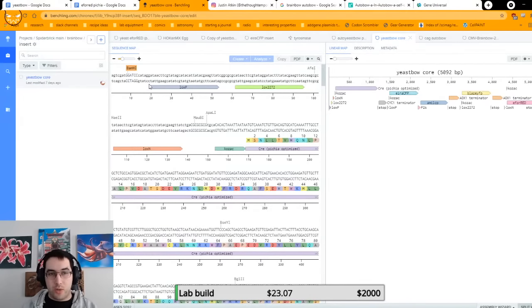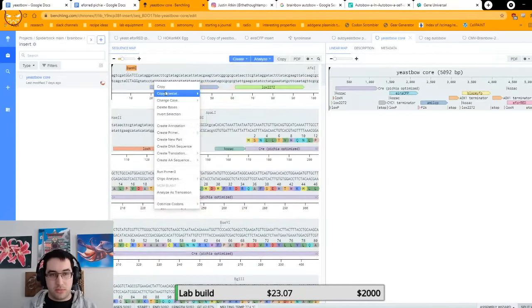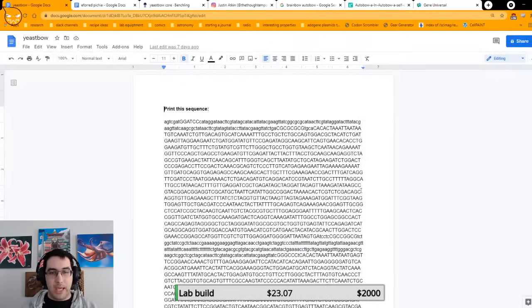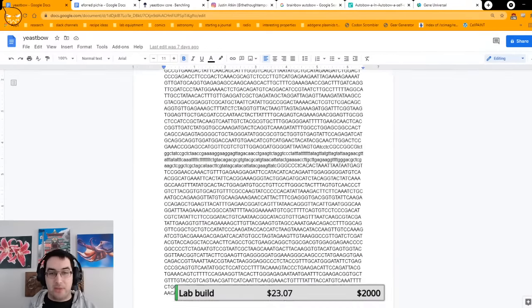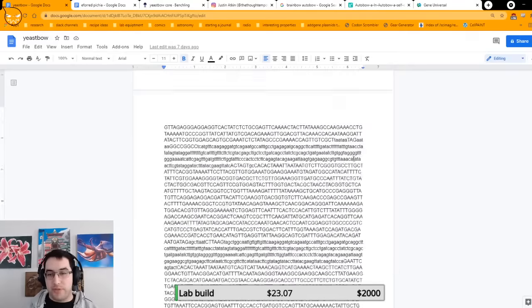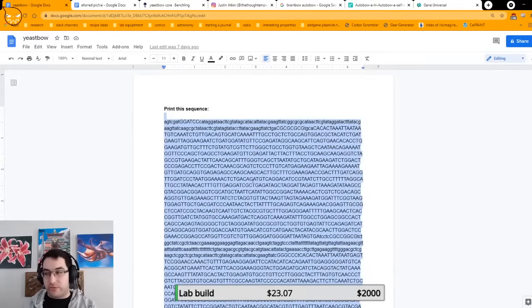So when I'm writing an order, I literally go Command A, copy. Then I go over to literally a Word document, which I realize sounds insane when you're talking about super high-tech DNA printing, but yeah, a Word document gets it done. And in big, bold letters, I say, print this sequence. Literally like, print me this. And it's just unformatted, there's random capital, lowercase, doesn't matter. It just gets parsed. So it's just a big wall of text of, make me this.